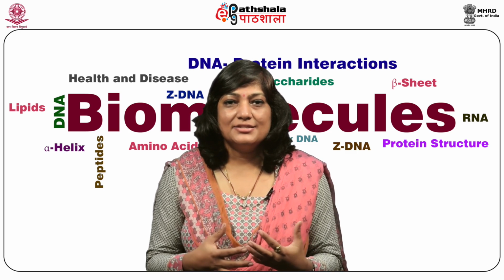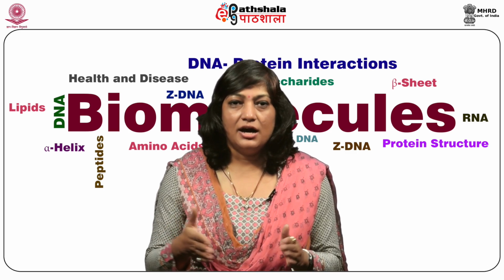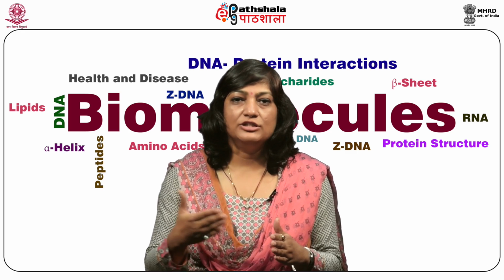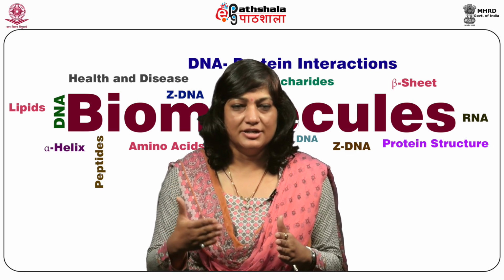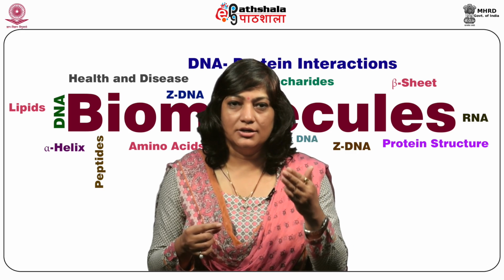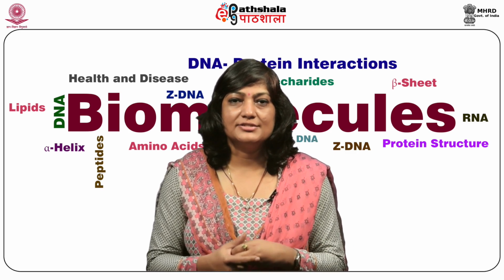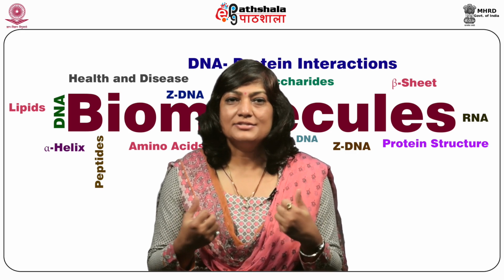Here, the substances to be separated are moved by an inert gas along a tube that is filled with finely divided inert solid coated with a non-volatile oil. So basically, the stationary phase here is a non-volatile oil that is coated onto a column. The migration of each component in gas-liquid chromatography is determined by its solubility in oil and its vapor pressure.